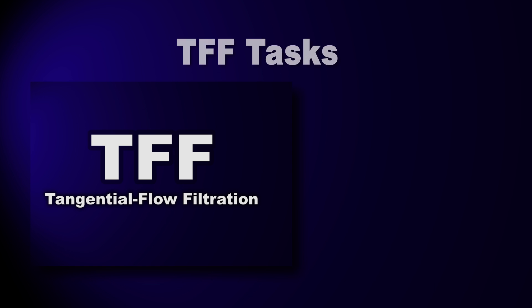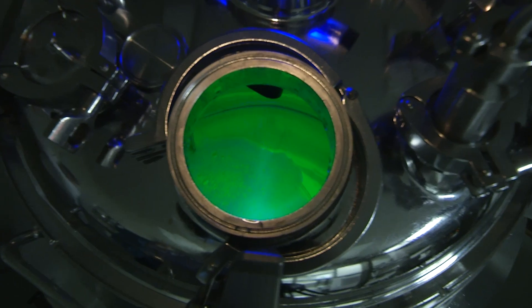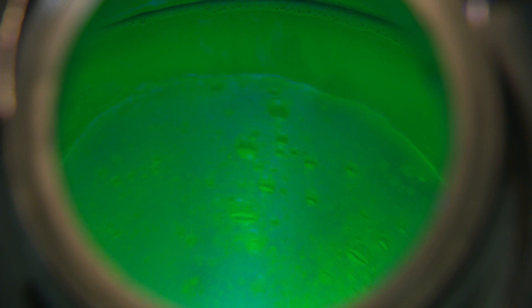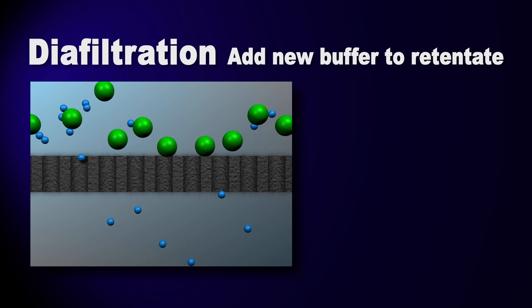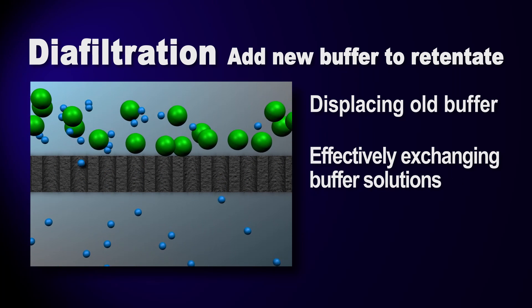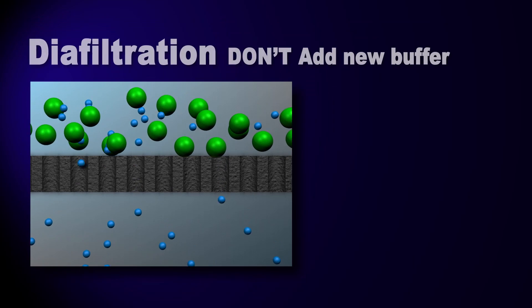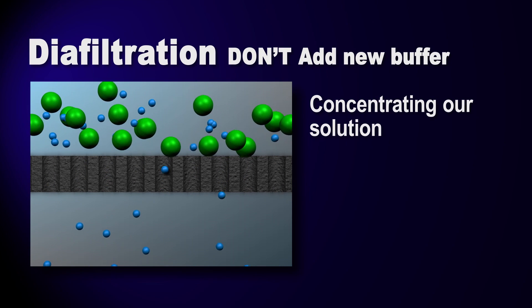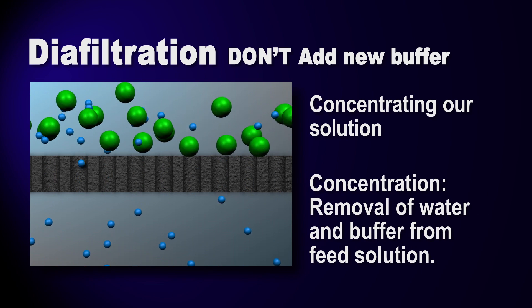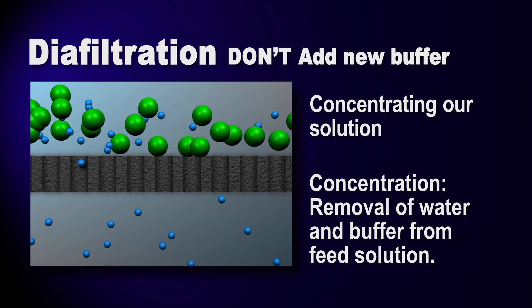We'll be using TFF for two different tasks within the purification process: concentration and diafiltration. We are processing purified GFP from a chromatography step. The fluid from the chromatography step is purified green fluorescent protein dissolved in a buffering solution. In diafiltration, we add new buffer to the GFP retentate while displacing the old buffer, effectively exchanging buffer solutions — note that the GFP is retained by the membrane. If we don't add a new buffer, then we're concentrating our solution — simply removing water and buffer components, resulting in a more concentrated solution of green fluorescent protein.